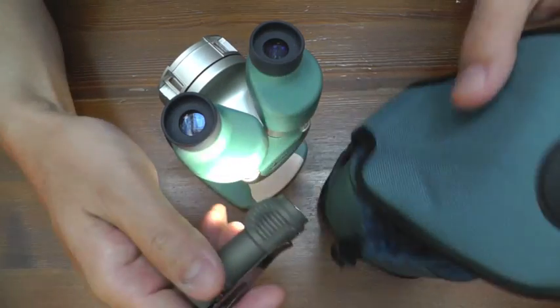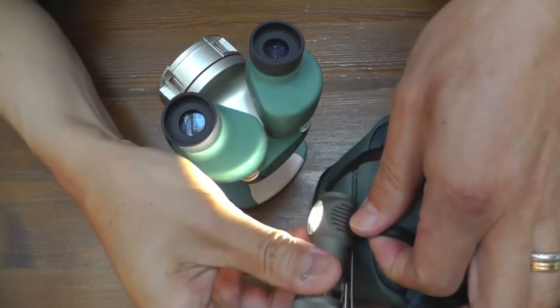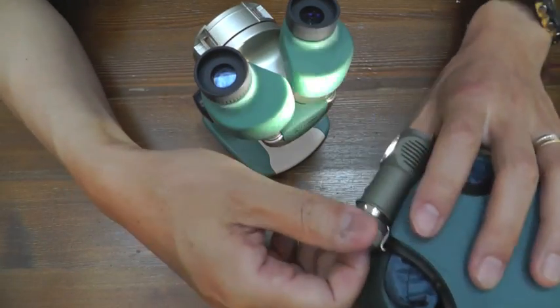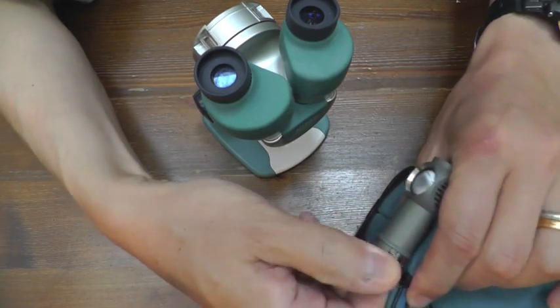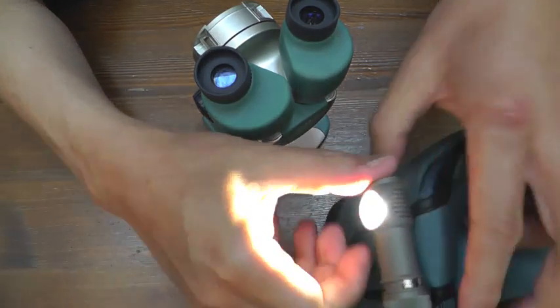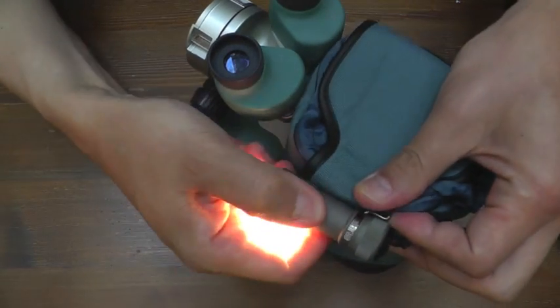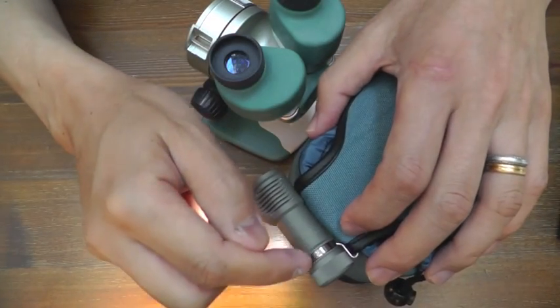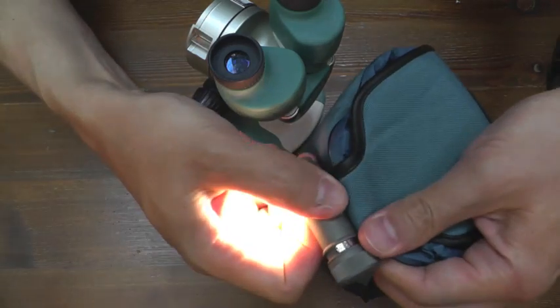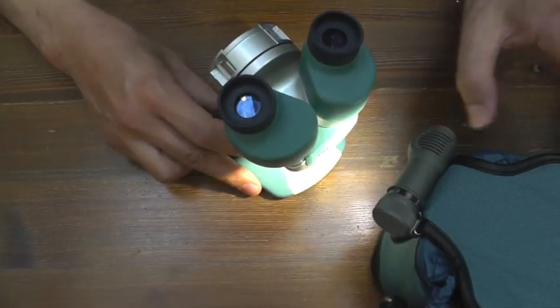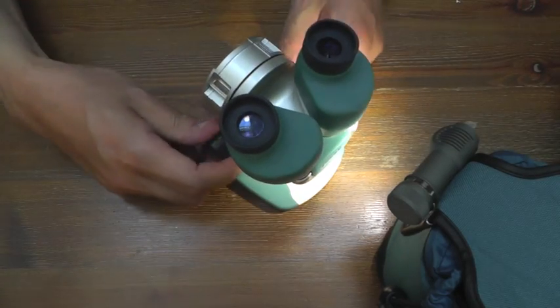Lamp here. On to the case. Clip onto the case. And I can change the angle like this. This clip moves, so I can change the illumination angle. Just good like this.